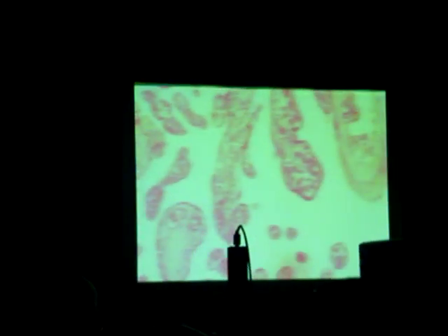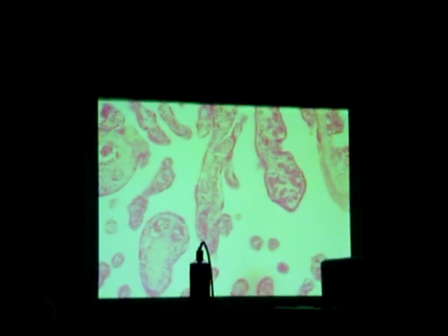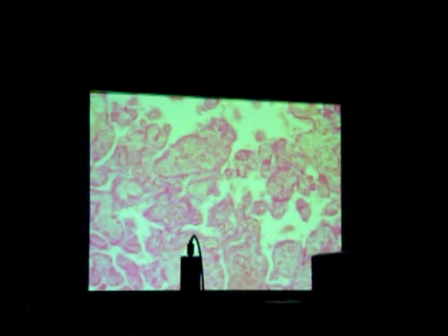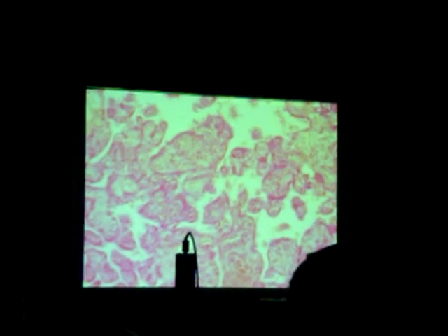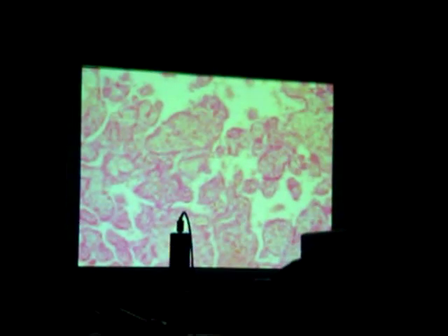Mariano di Fiori — so I don't make a mistake here — that's the decidua basalis where it's dense, and then when it opens up, that layer's called the chorion frondosum. I think those are called villi in the chorion frondosum, and these are uterine glands in the decidua basalis — but it could be the other way around. I'm going to say those are uterine glands in the decidua basalis. Let me find that — it came from the placenta. Probably what I said is correct; I haven't looked at that in a year and I always get those mixed up.